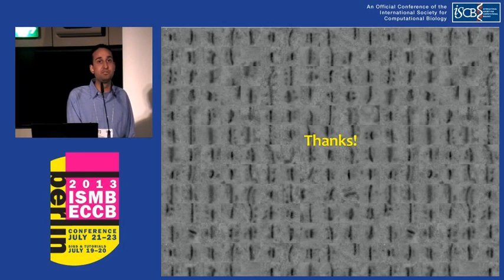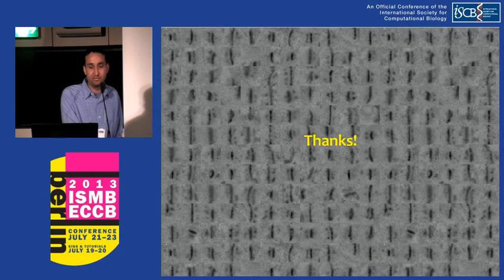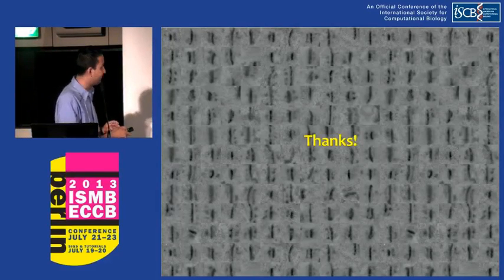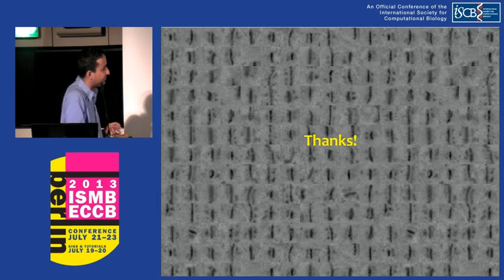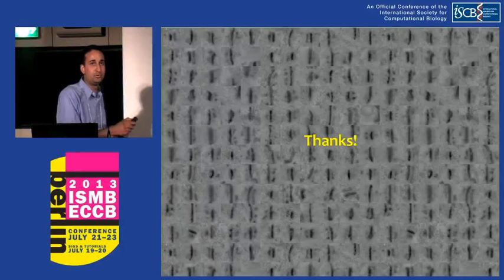We know a lot about what they look like using standard EM, but there hasn't been as much work looking at that. Okay, if we try to stratify the data by the parameters we have for the analysis, for example the length and the width, will you see classes? Yeah, we see three different classes. I don't have a slide for it now, but I can point it out. We see some synapses that look like this, where you see this prominent postsynaptic density and these little dots to the left of it that we think are vesicle release sites. Then we also see these where you just see the band itself, and then something like these where you see a very dark band and a lighter band on the presynaptic side. So we think these are three different classes of synapses. We don't know what they correspond to biologically, but we're trying to investigate that now.